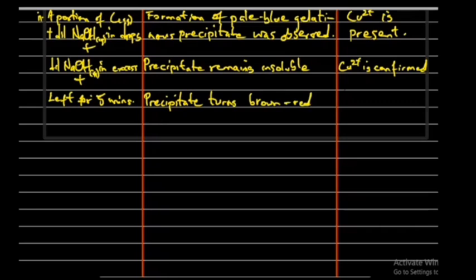This tells us that there is reducing sugar present in that substance.